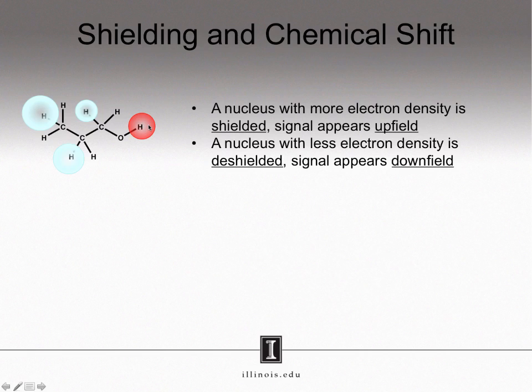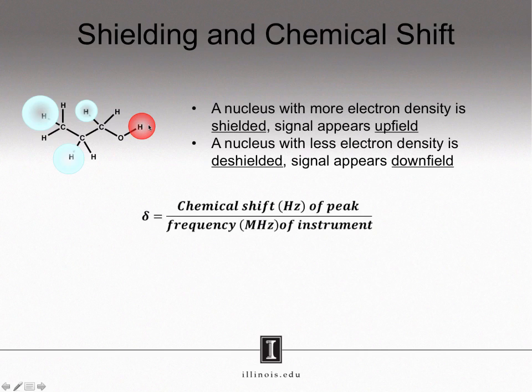In the NMR spectrum for 1-propanol, you've seen how signals have appeared at particular values on the x-axis. Where do those values come from? Those values result from a comparison to a standard. Remember how we standardized NMR spectra by using ppm as our unit for chemical shift. To decide whether a signal appears at 3 ppm or 9 ppm or 1 ppm, we make another comparison.